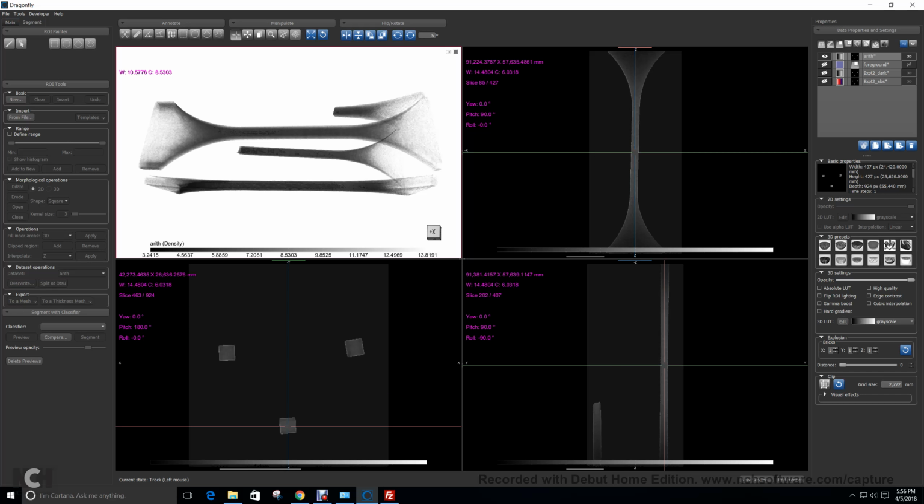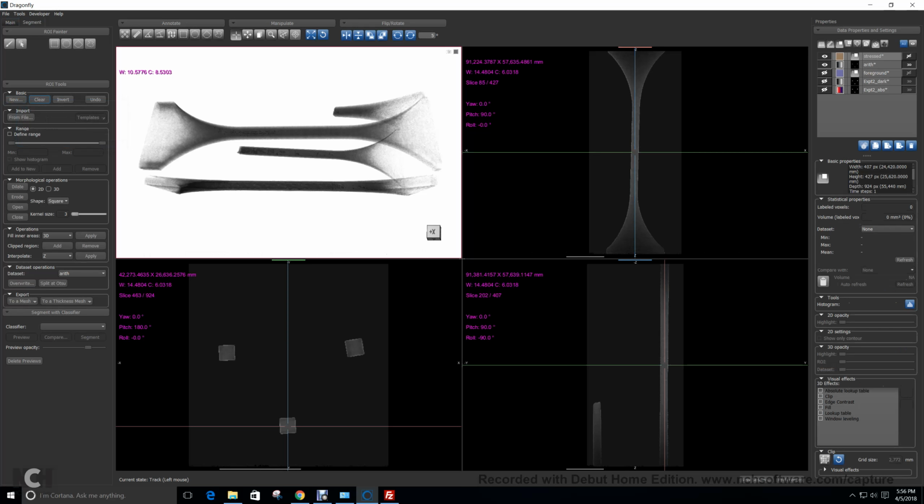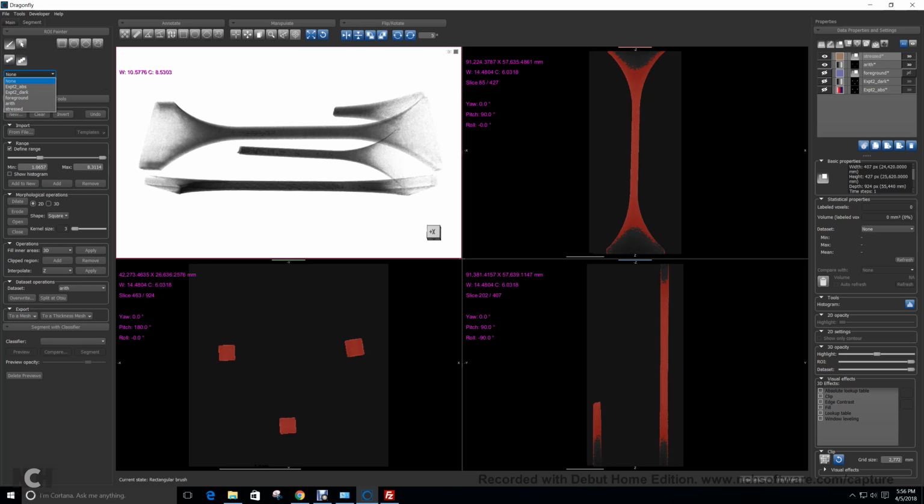And then create another ROI tool, we call it stressed. Define the range. We need to enable the 3D first. Enable the 3D and click the ROI Painter tools, choose Array, and hold the Control key to make the pointer bigger.